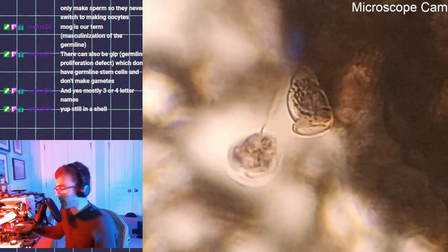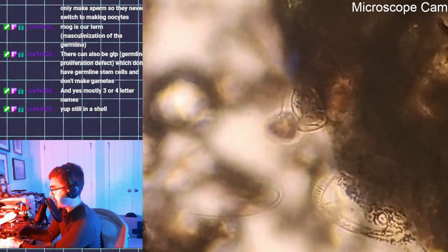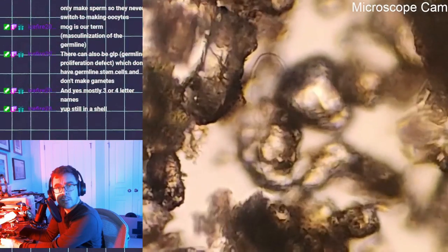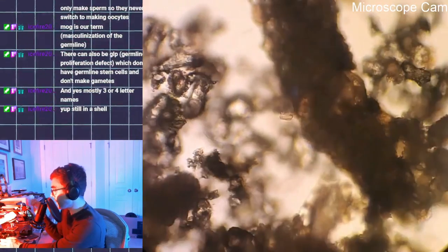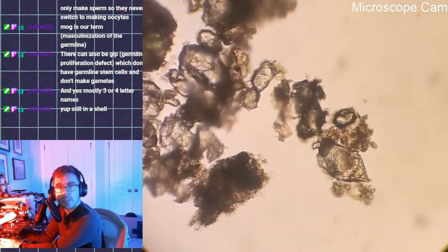Okay, so, right, stentor, is that still there? Yeah. At least I think so. It's hard to tell. The one on the left is definitely vorticella. I think the one on the right is stentor. It's just hard to get a good look. Oh, there's something else right there. Oh, it's one of the filter. Yeah. Maybe if it's broken up a little bit more, we'd be able to see it better. Yeah, okay. So almost got to see what I wanted to see, but it was a little crowded.